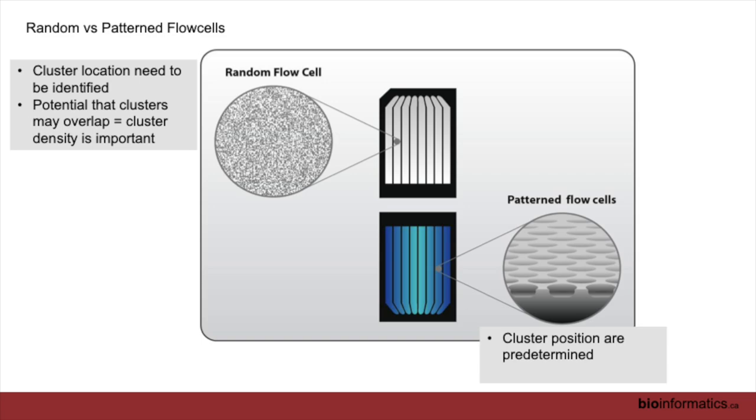In recent years, the current sequencers, most of them, are using patterned flow cells. So here the cluster positions are predetermined. That's brought in a lot of solutions to some issues that came up with the random flow cells. It's also brought in a few issues that had to be addressed as well.